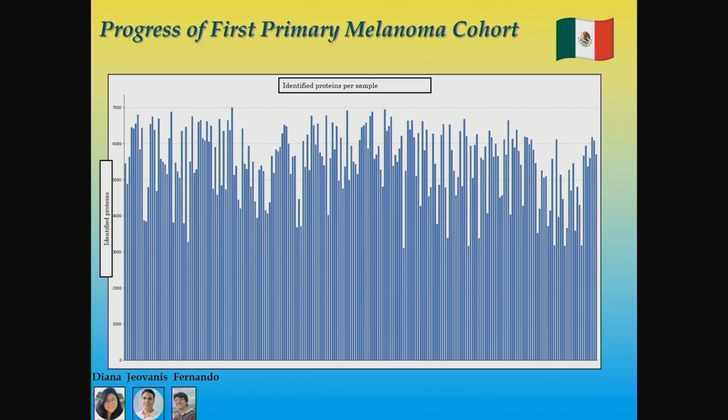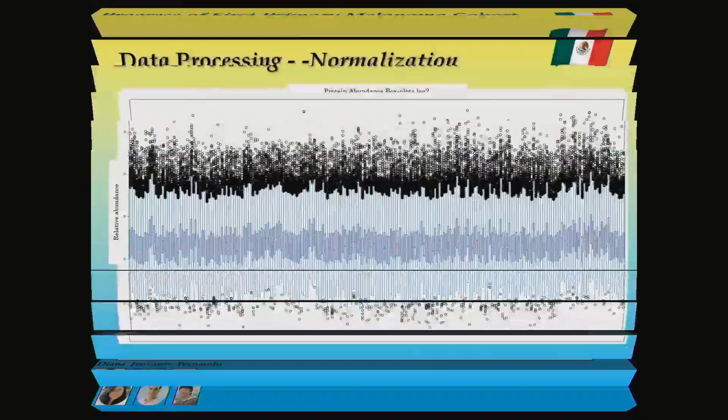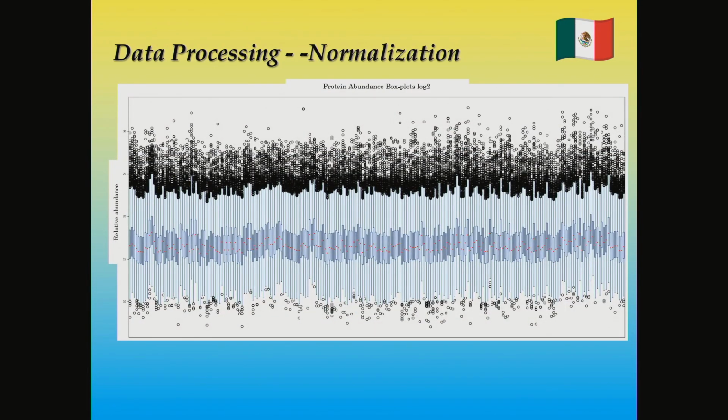When you compute, you also need to normalize data so you get an equilibrium, because this is run over a period of time, and you have internal standards, controls, and also a mixed control that we use. By doing that, you can get really reproducible and very strong data. You are in the range of around 20% relative standard deviation at high numbers, which I think is very good at this stage.